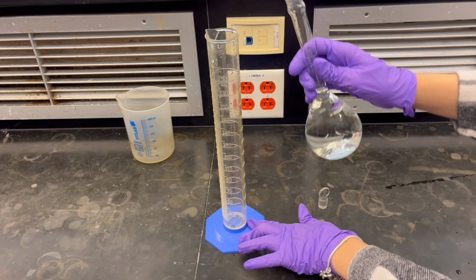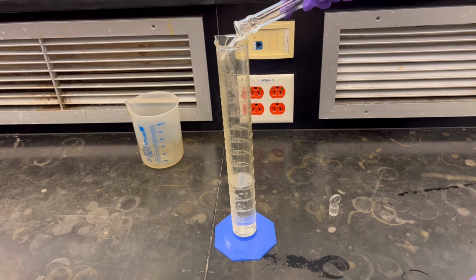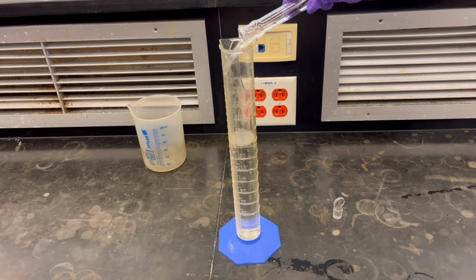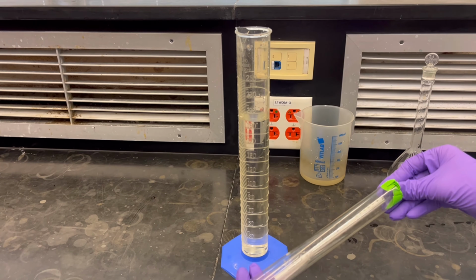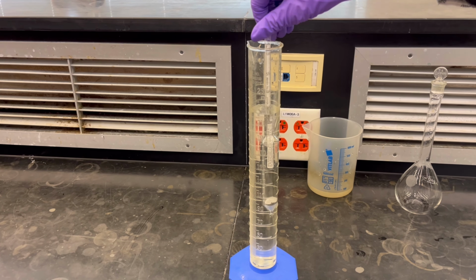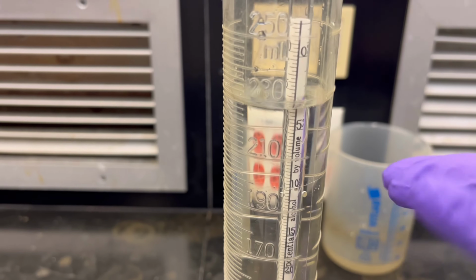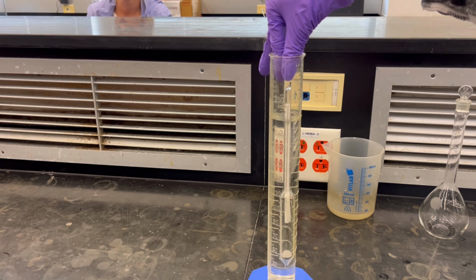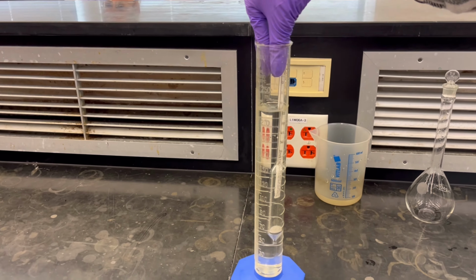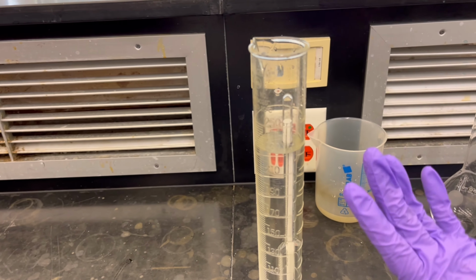Now follow your manual and make the 3 standard solutions. Now we will do the same steps for our 3 standard solutions. We will fill the cylinder to the 200 milliliter mark as we did with the DI water. Afterwards, getting our hydrometer, we will measure the specific gravity of the solution. Make sure to insert your hydrometer slowly so it doesn't hit the bottom and break. And if there are any air bubbles in the solution, we have to remove them. We can remove them by spinning the hydrometer a little bit until the air bubbles disappear, so we have an accurate measurement. Afterwards, you can read the specific gravity for each of the solutions.